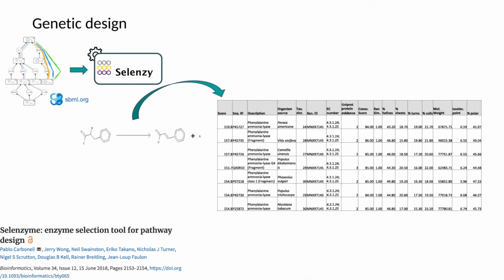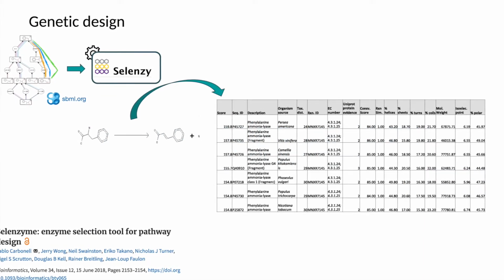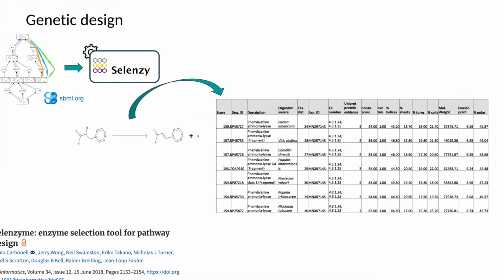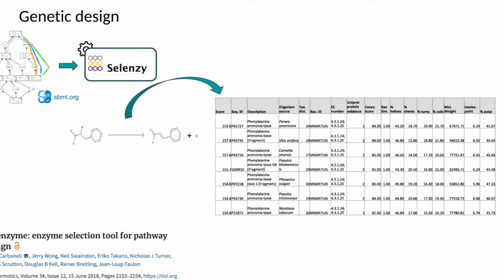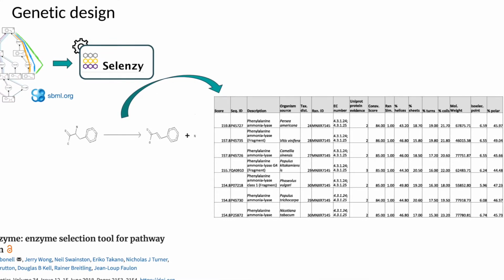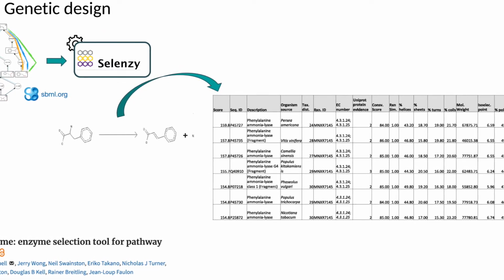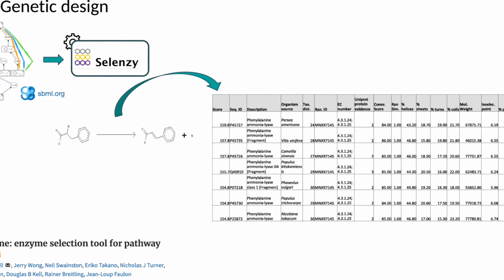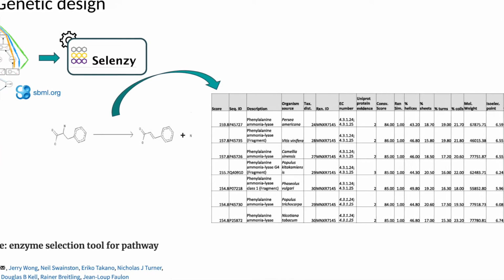The basic assembly workflow generates assembly plans for plasmids using the BASIC assembly technique, which stands for Biopart Assembly Standard for Idempotent Cloning. This workflow takes as input a pathway and generates Python scripts to operate an OpenTrons liquid handler robot, which will perform assembly and chassis transformation. This workflow hence provides a direct link between machine-enabled design and automated assembly.